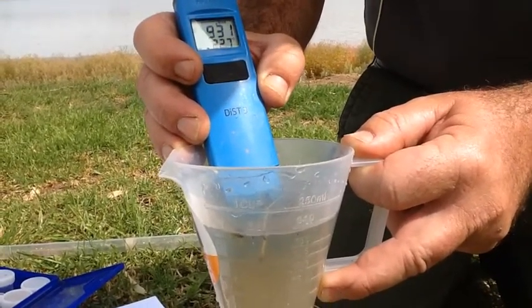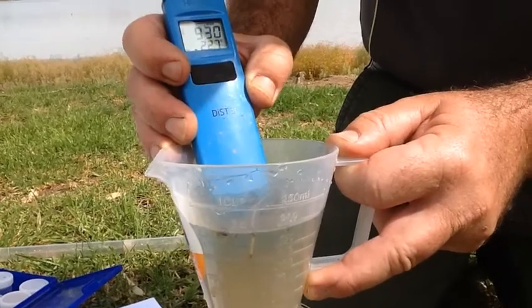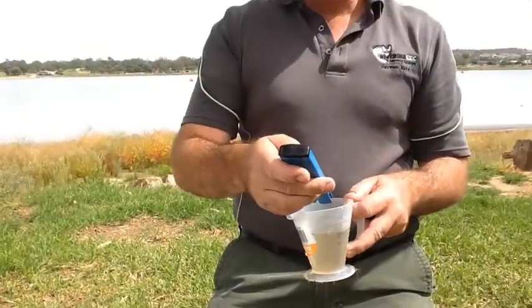930 microsiemens per centimetre at 22.7 degrees Celsius. We'll talk about the results in a later video.